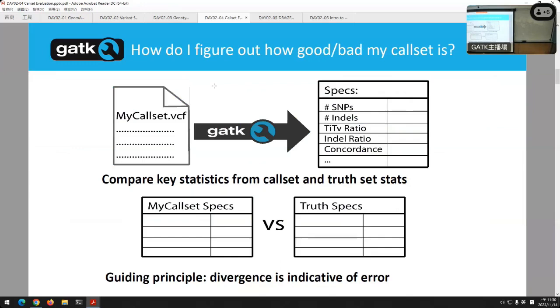The important thing to gather, though, is that you're going to try to find another call set to compare to. And finding the correct truth set is actually pretty important, because the statistics that you compute here won't line up. There are lots of good call sets that will have different statistics than yours. So what we're going to go over is how to find the correct truth set to compare to, because it's really important. Like I said, we have no source of truth in advance when you sequence someone. That's the purpose of sequencing, is to try to find that. So to compare, you have to find something that's going to provide a good equal comparison.